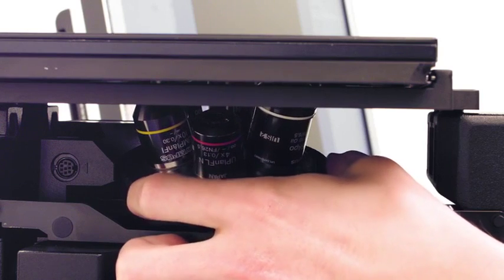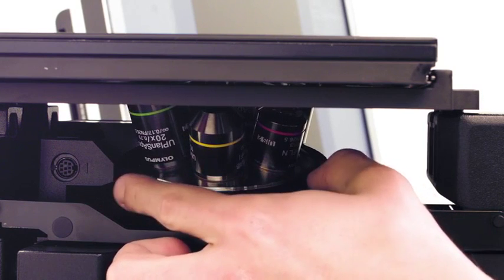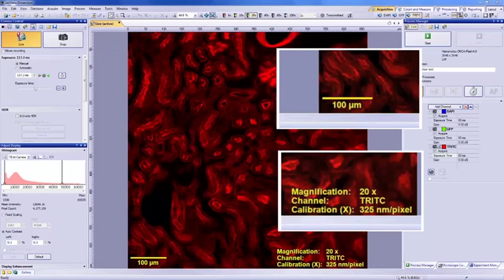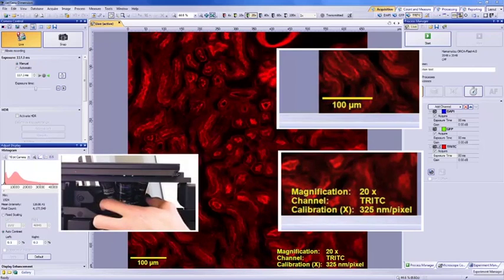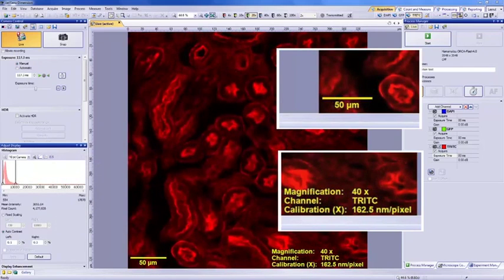The IX-73 coded nose piece ensures the researcher never has to question the size of features in their image again. Changing from the 10x to the 20x objective lens here updates the scale bar. In the image metadata, the pixel size is automatically updated for accurate quantitation of sample morphology.